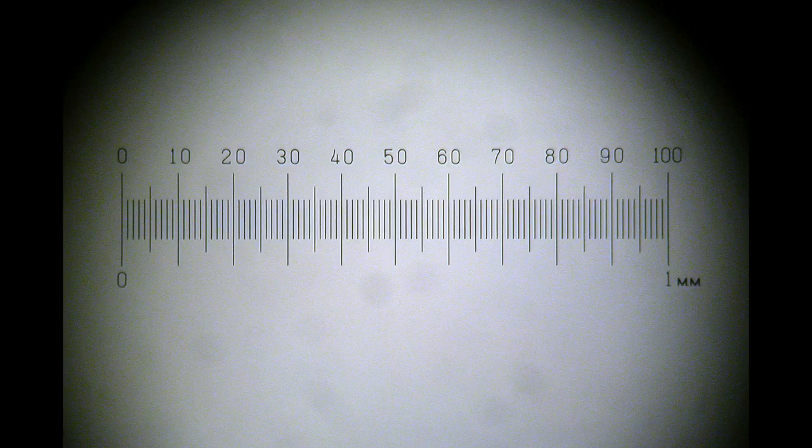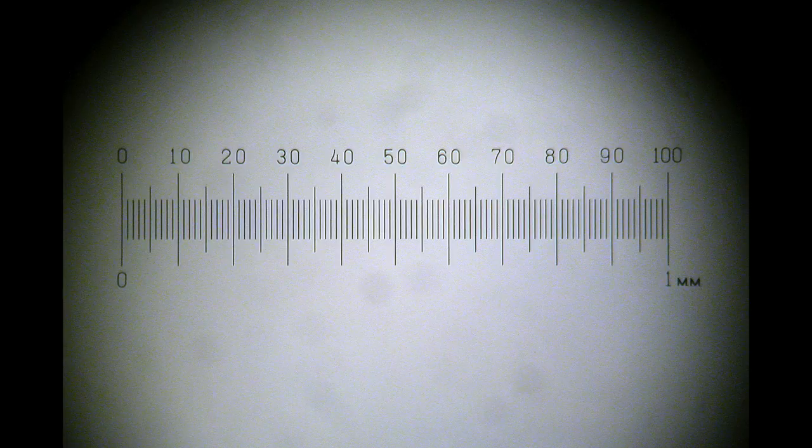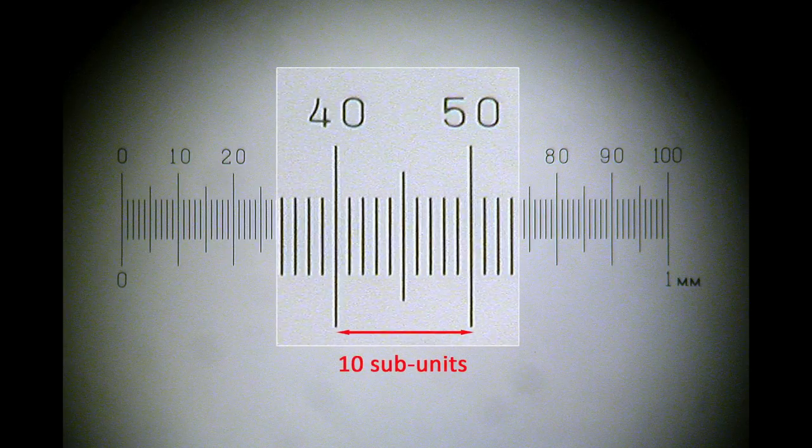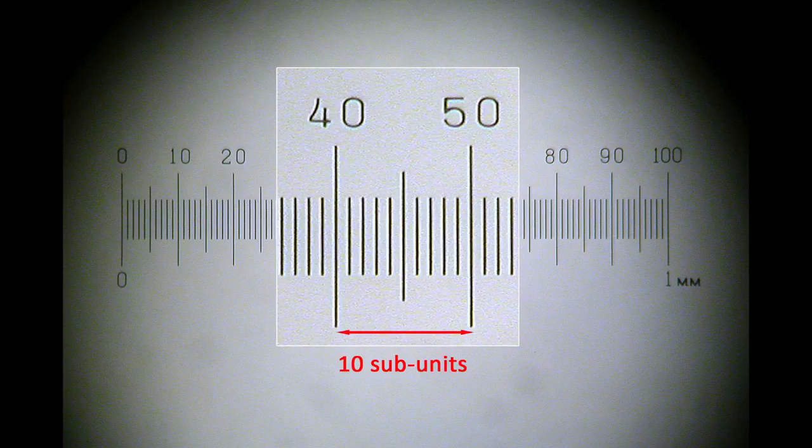You can see that this 1mm scale is divided into 10 blocks, 0-10, 10-20 and so on, up to 100 on the far right. Notice also that each block is further subdivided into 10 subunits, with a marker point at the 5th subunit. So what you're actually seeing is 1mm divided into 100 subunits, seen here.